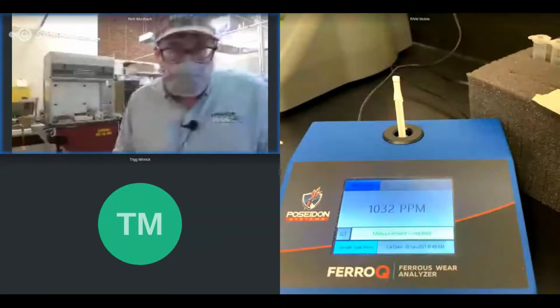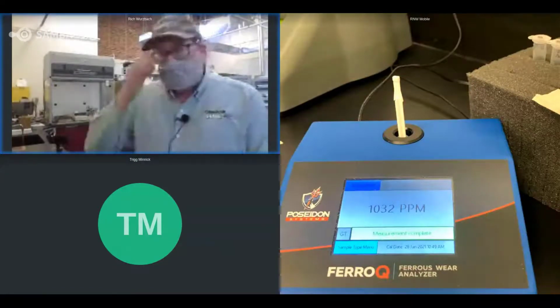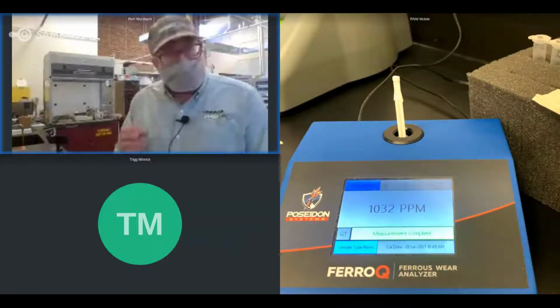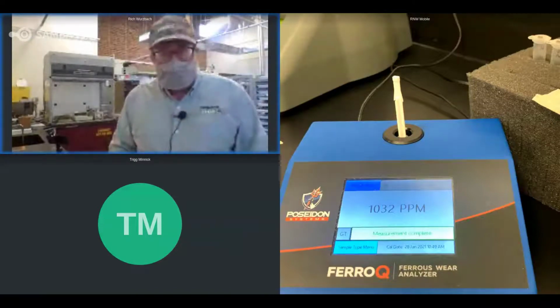So the question here about ferrous content that I saw was: explain the difference between elemental iron that we might see on a report versus this ferrous content. And it's a really good question because they're really not measuring precisely the same thing.